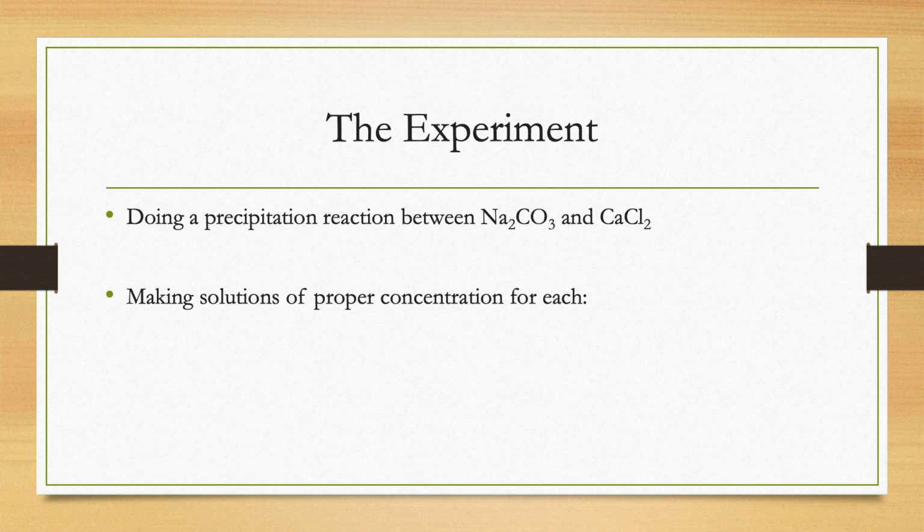Now, I think that's plenty on the background here. So what I do want to spend some time on briefly before we wrap up is the experiment itself. The lab this week is relatively short, particularly if you are pretty comfortable making your solutions at the start. That's probably the part that takes the longest. The reaction itself happens very, very fast once you do it, and then it's just one filtration at the end and you're pretty much done.